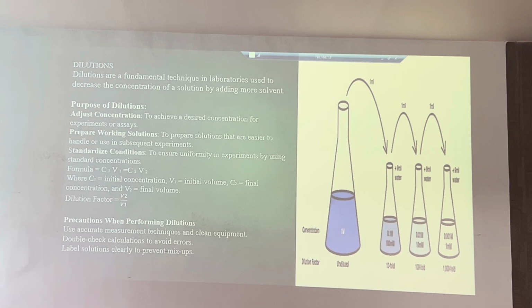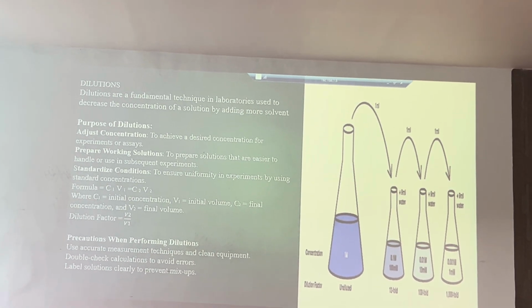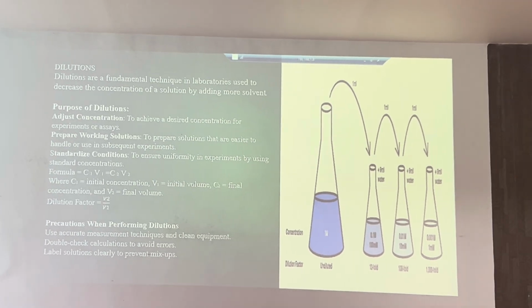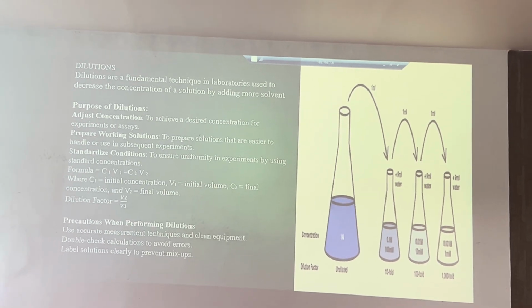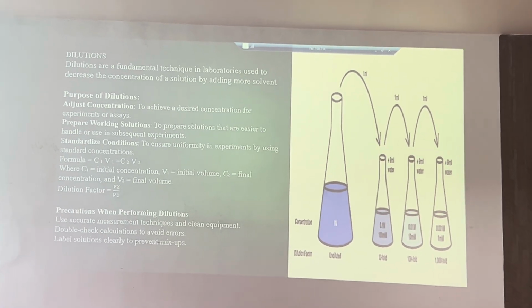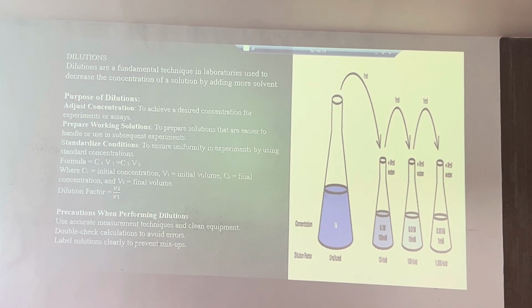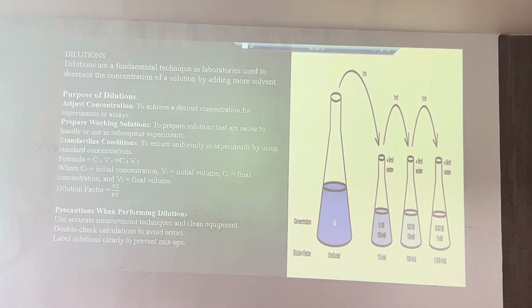Next. Dilutions are similar. Whenever you are doing any kind of dilution, in the simplest way, always remember: first, mark your flask properly. Without labeling the flask, you should never do any dilution. I have seen so many OOS results happen because the flasks were not properly labeled.